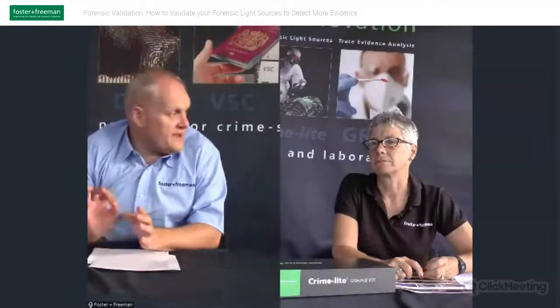And if you want the best performance, you do need a different filter for every single wavelength. And also the non-reflective, because as you move to the higher powered light sources, you can cause fluorescence in the glass or in the plastic, which reflects back onto the surface that you're examining, and then that will mask or hide the fluorescence of the body fluids. So we have special coatings on our filters that stop that happening.